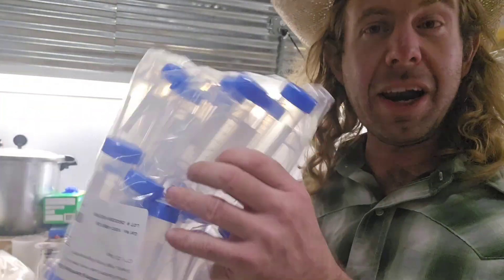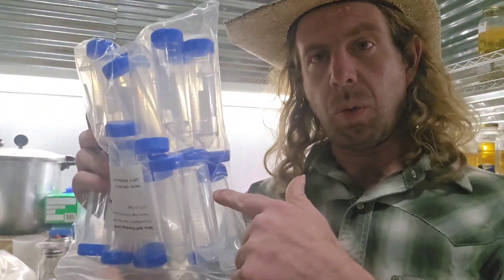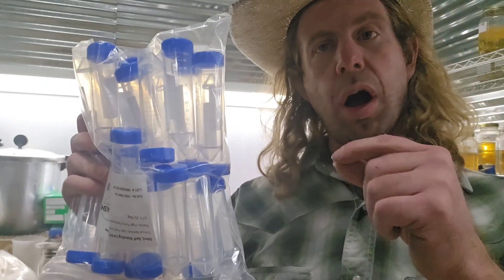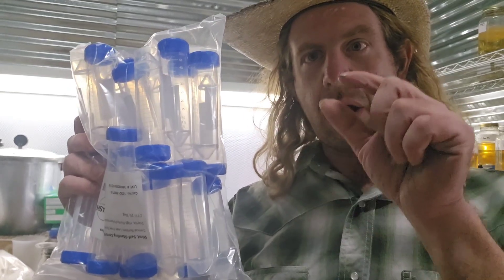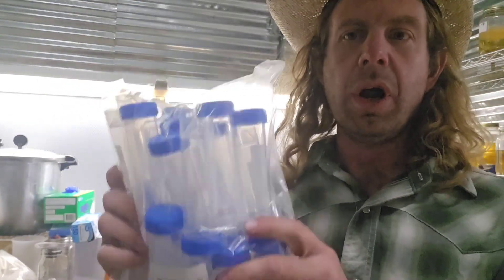Number twenty-four: centrifuge tubes — these are 50 milliliter. I like to put sterile water in these, and these are for long-term culture preservation. What I do is grow out a culture on a petri dish, allow that culture to grow out, take the leading edge of the mycelium, cut a ring around it, make little cubes of that agar with the leading edge of mycelium, and plop them in here for long-term storage. Number twenty-four: centrifuge tubes.